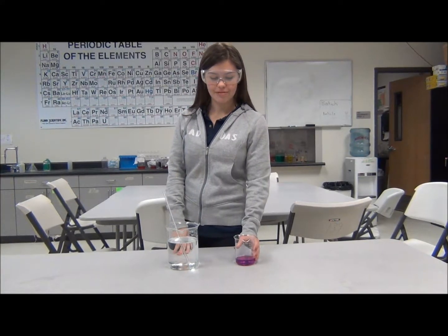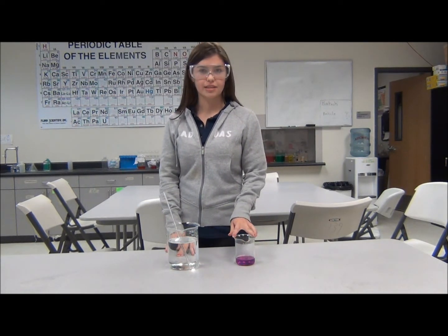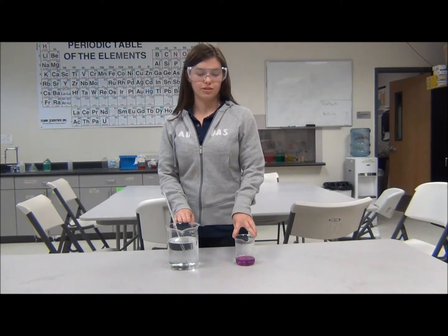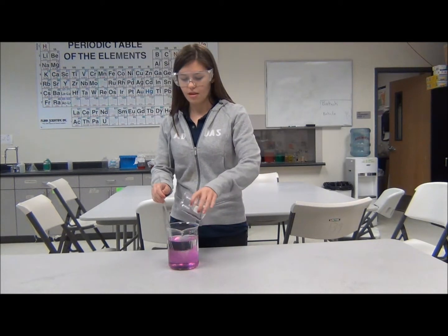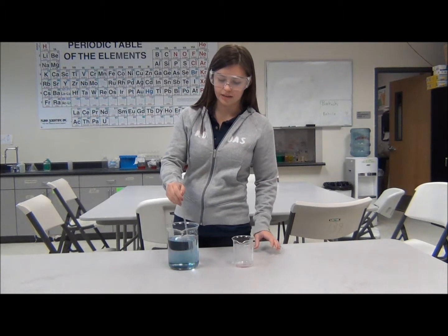Hi, today I'm going to be performing the chemical chameleon demonstration. This is potassium permanganate solution, this is sodium hydroxide and sugar solution, and I'm going to mix these two together. What you'll see is that the solution is changing color.